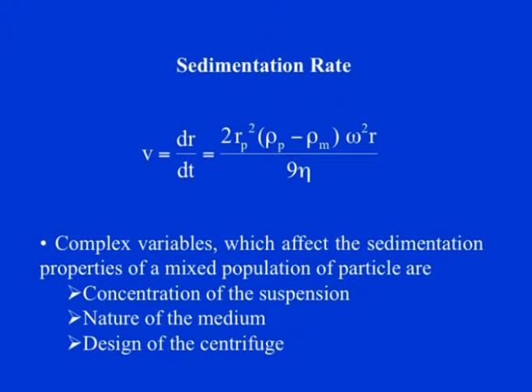All right. Now, another term, like the sedimentation rate we were talking about, and we have talked about this equation here. These complex variables which affect the sedimentation properties of a mixed population of particles also depend on the concentration of the suspension, the nature of the medium, and the design and handling of the centrifuge. All these things affect that.